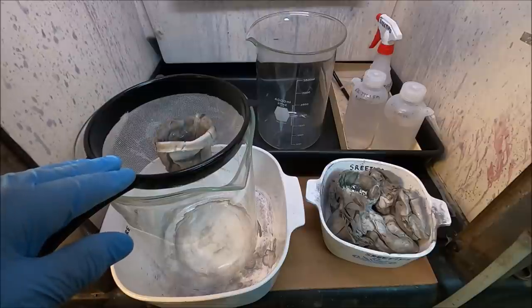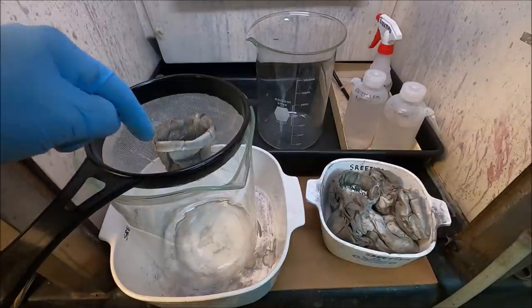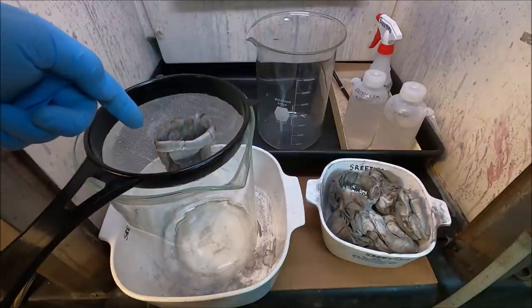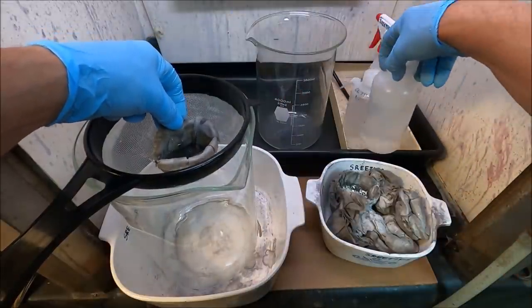This was recommended by one of my viewers. The idea is that if we can catch that silver in the screen, we won't have to dissolve it with the other slimes that are in the filters. So let's take a look here and see what we've got.